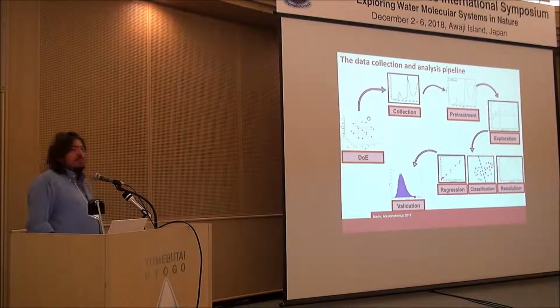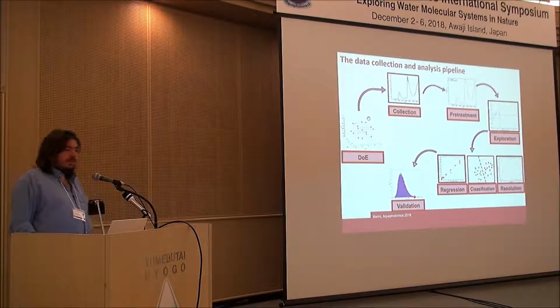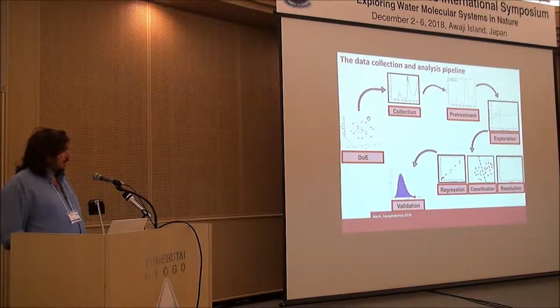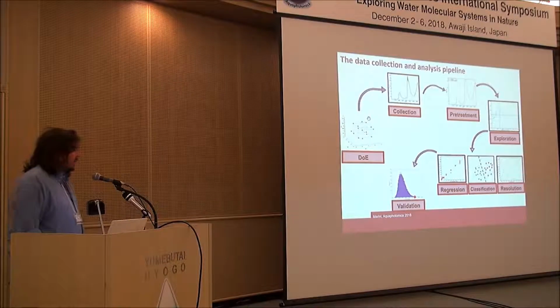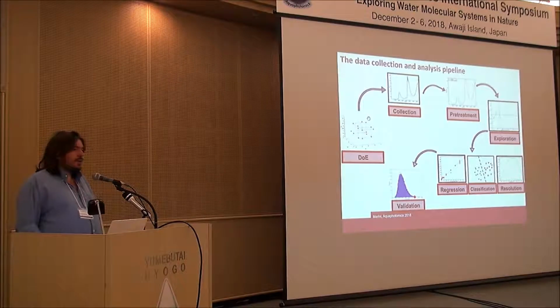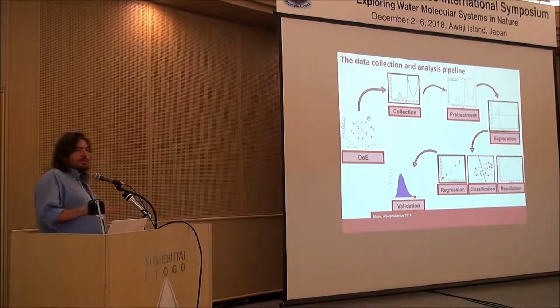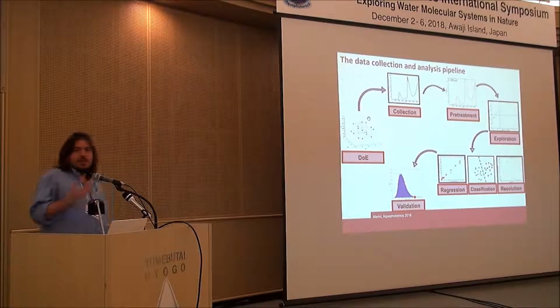A fundamental part of all this discourse is that, of course, we cannot be satisfied with any possible model if we don't do any proper validation of the results. Validation is sometimes thought of as covering only the predictive part of the models when predictions are involved.